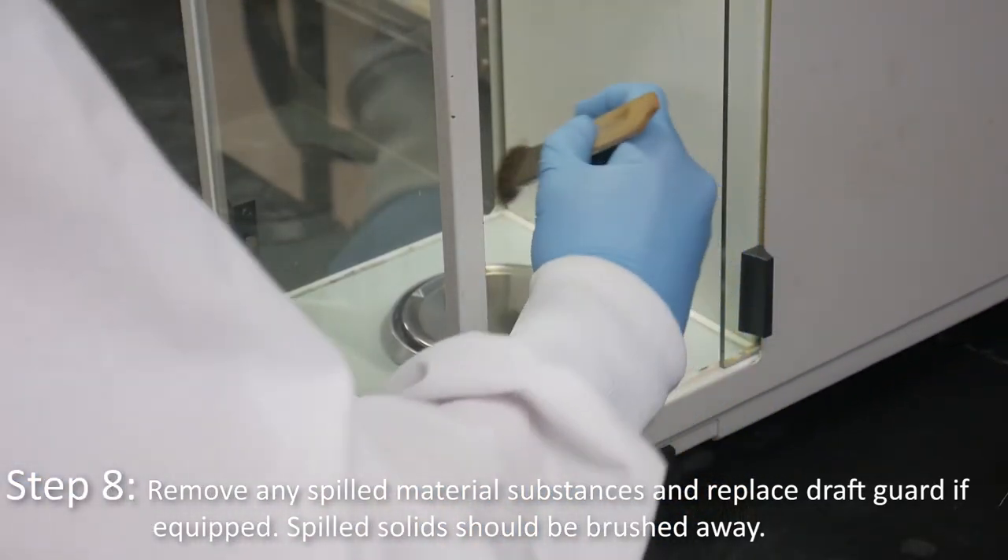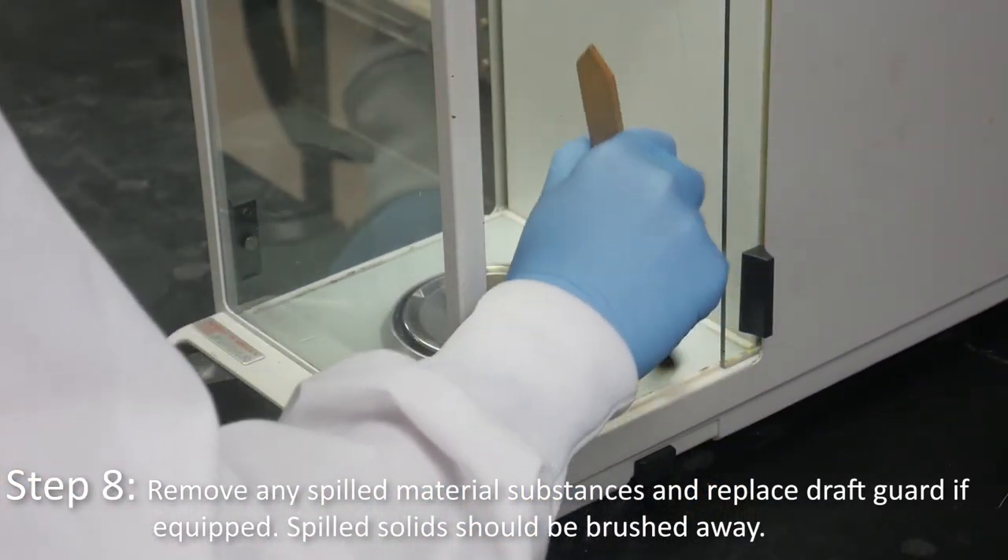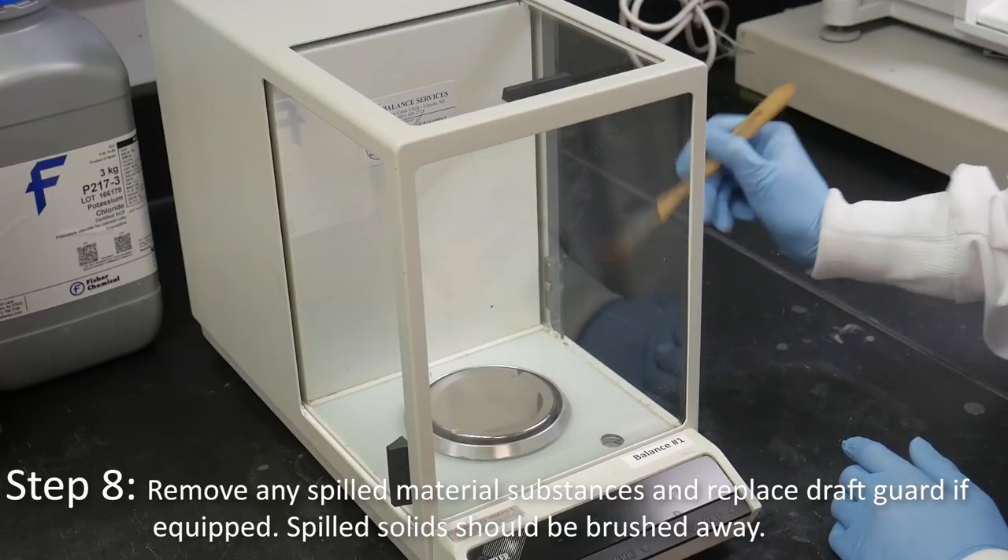Remove any spilled material or substances and replace the draft guard if equipped. Spilled solids should be brushed away.